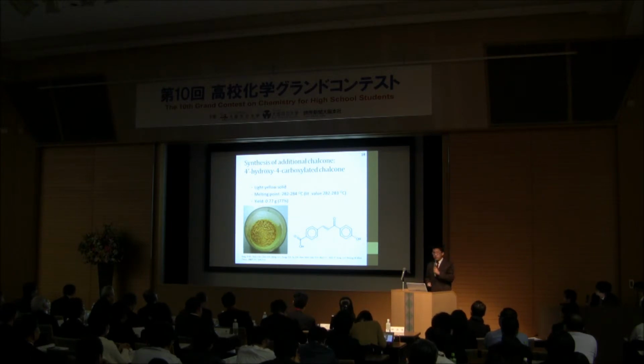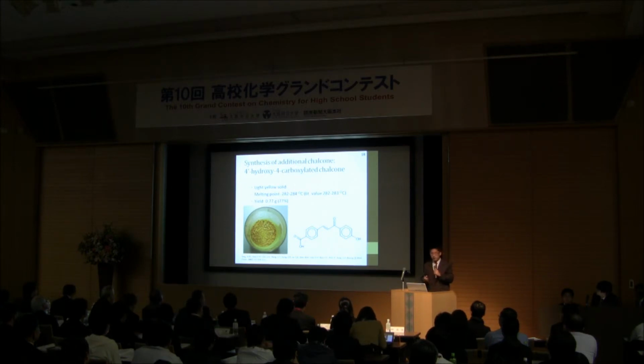The melting point test showed that we had a melting point of 282 to 284 degrees Celsius, which is very close to the literature value of 282 to 283 degrees Celsius, again indicating that it was pure. The yield that we obtained was 77%.